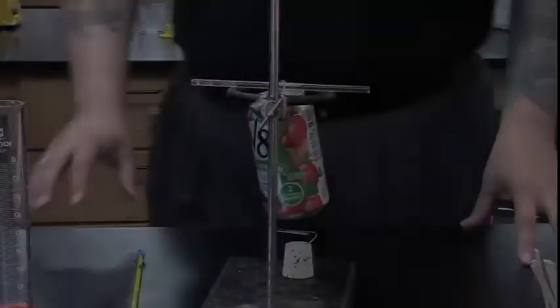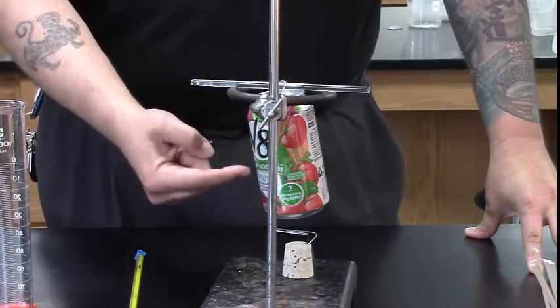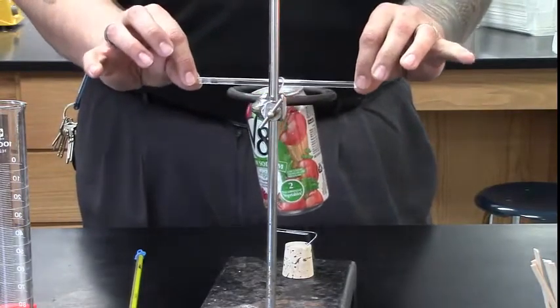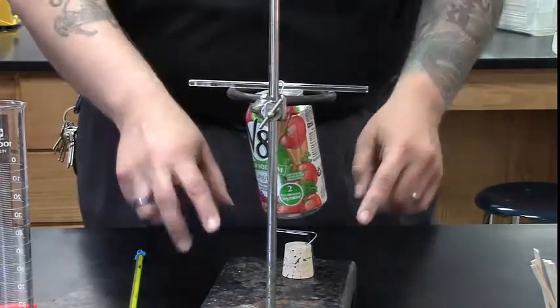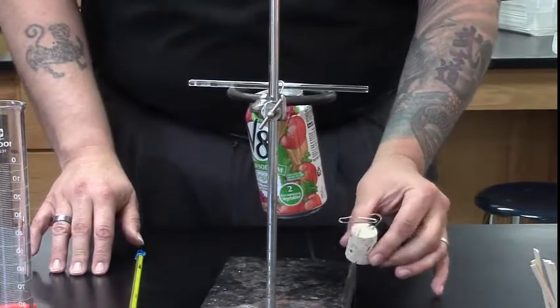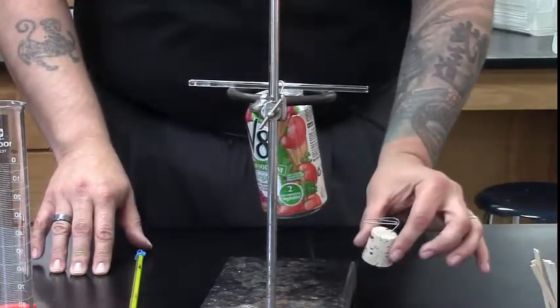Let's take a look at what we're using. So here's our setup. We have a soda can suspended by a glass rod in an iron ring and ring stand, and underneath that we have this cork with a paper clip. That is going to be our food support unit.